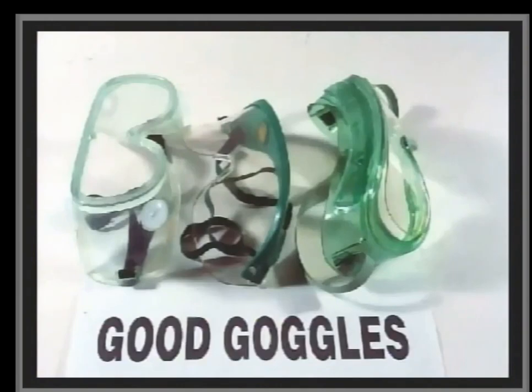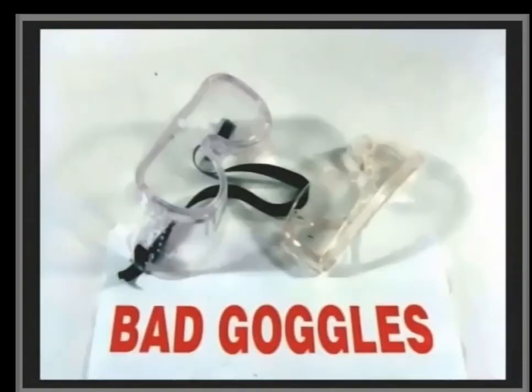These goggles are all acceptable for use in chemistry labs. They are indirectly vented, which means they won't fog up, but ventilation holes are covered. All of them are marked with the code Z87, showing that they meet the requirements of OSHA, the Federal Occupational Safety and Health Administration. These goggles and glasses are not good enough for chemistry labs.